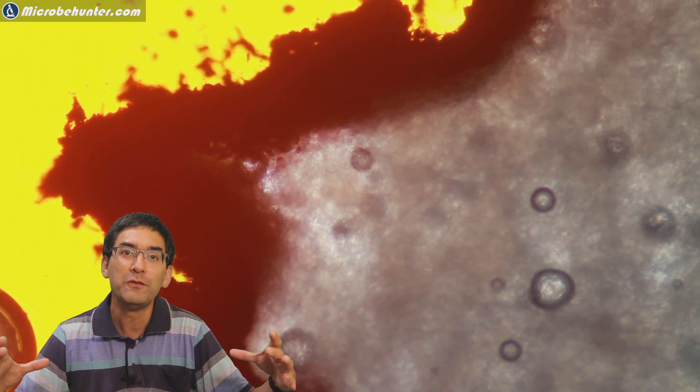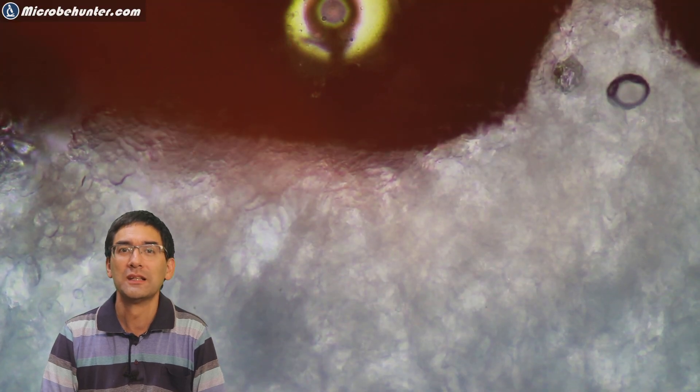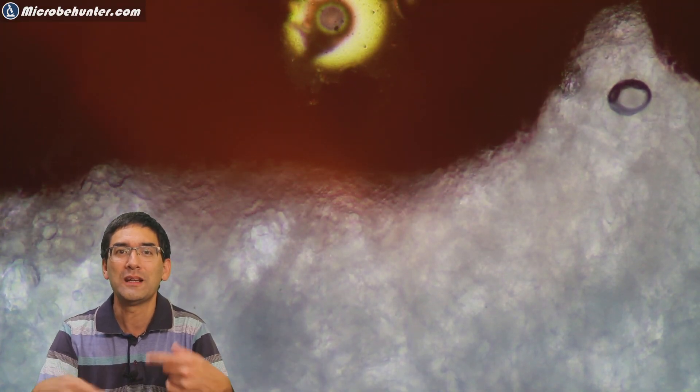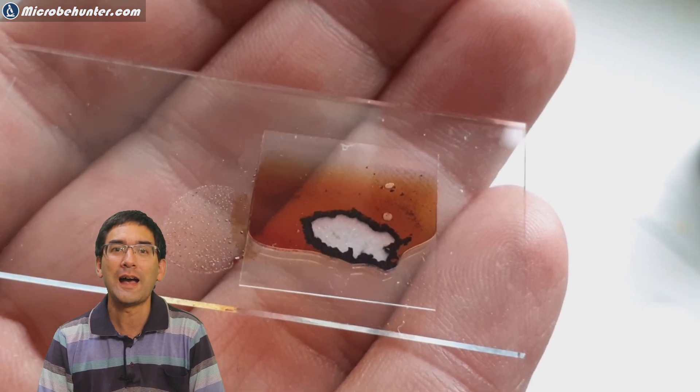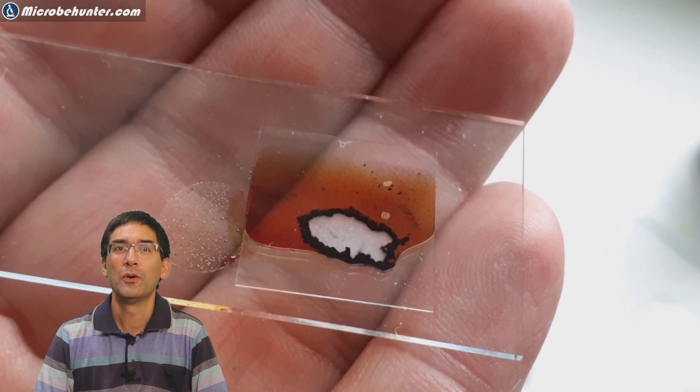You can see here how this iodine diffuses into the bread. This is a little bit of a time lapse to make it run faster, so you can see how the iodine soaks into the bun and does the iodine and starch reaction, making it black. Here's how it looks after a couple of minutes of diffusion.